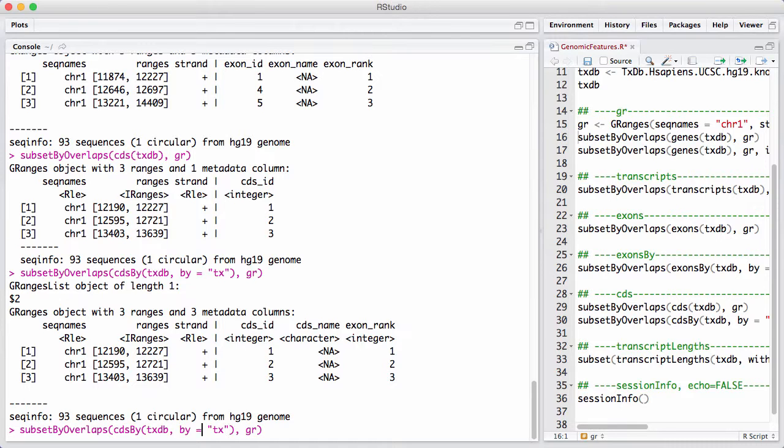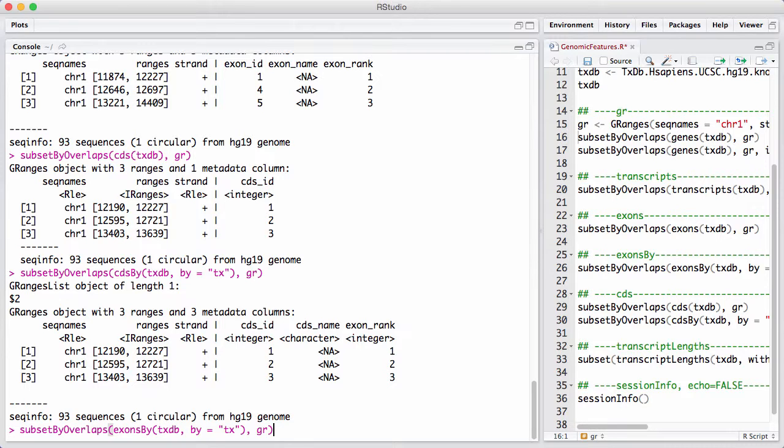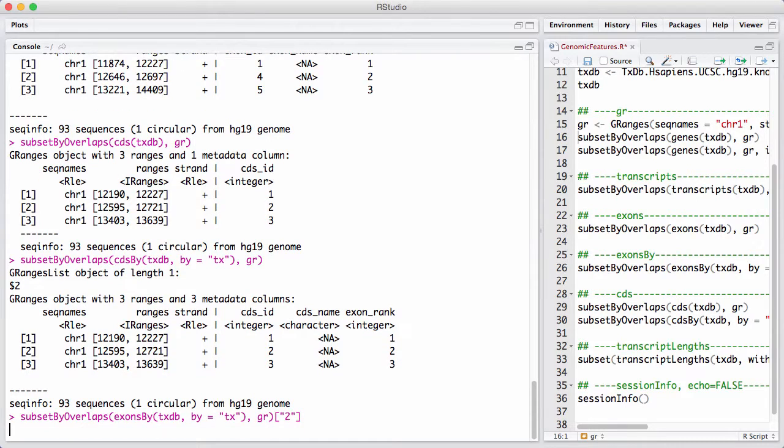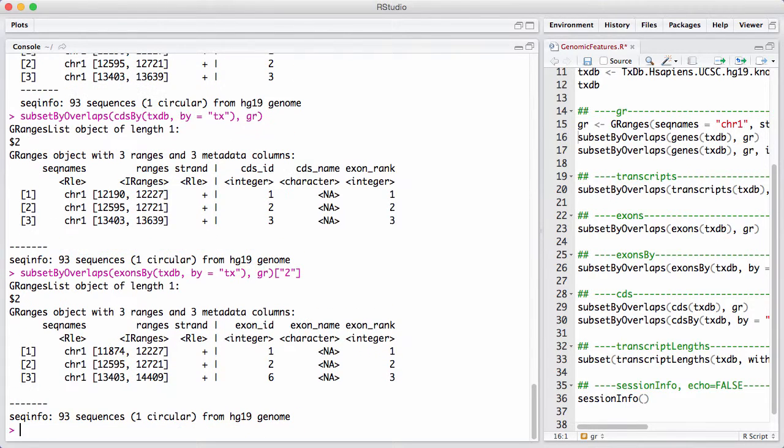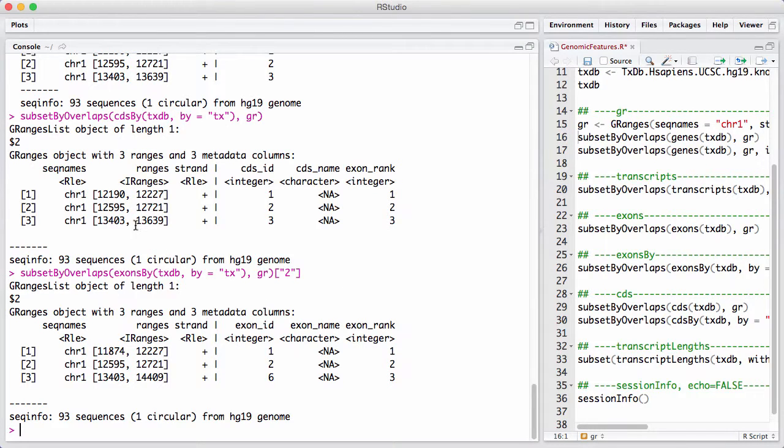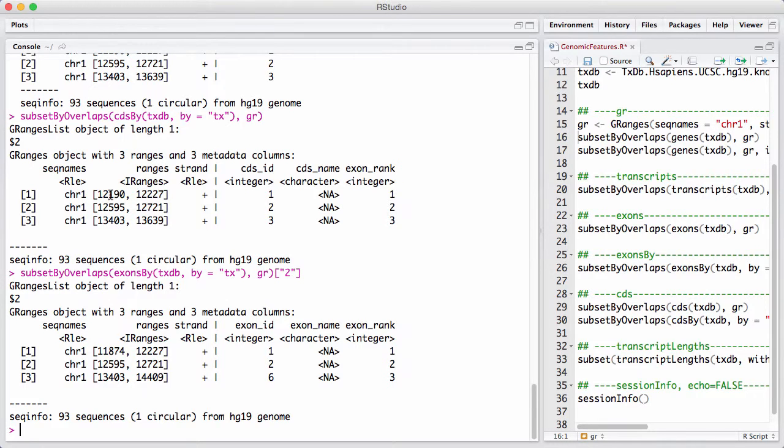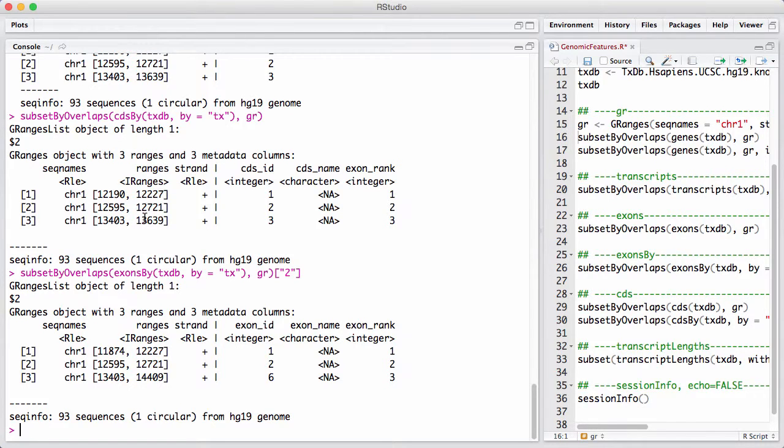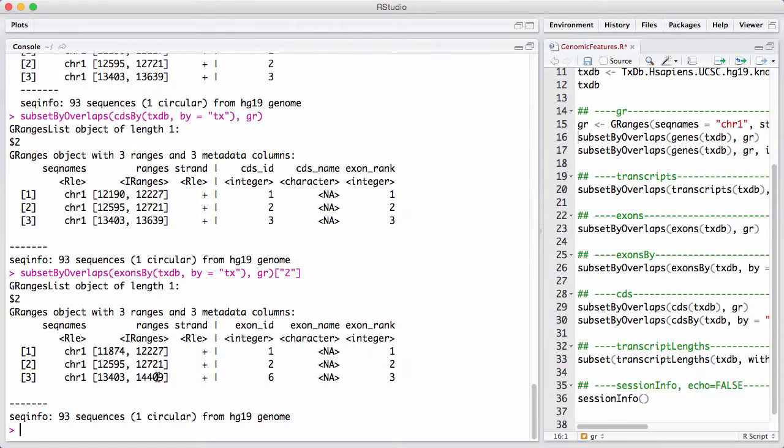So, this is really the exons of the second transcript intersected with the coding sequence of that particular transcript. For comparison, let's do the exonsBy and let's select the transcript number two. Note that I use character here. So, you can see that the middle exon is fully part of the coding sequence. In the first exon, the coding sequence starts a little bit into the exon, and in the last exon, the coding sequence ends a little bit before the end of the exon. That's very common. That shows us what the three prime and five prime untranslated region of the gene is.